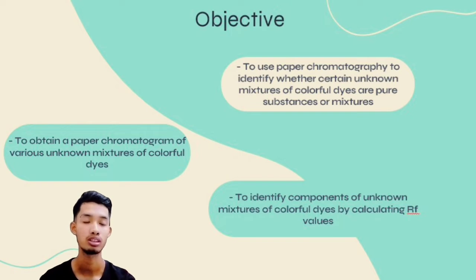The components of a sample move at various rates along the filter paper in chromatography, causing them to spread out and become separated from one another. Chromatography can be used to separate inks, dyes, pigments in plants, or to determine the chemical composition of a substance.